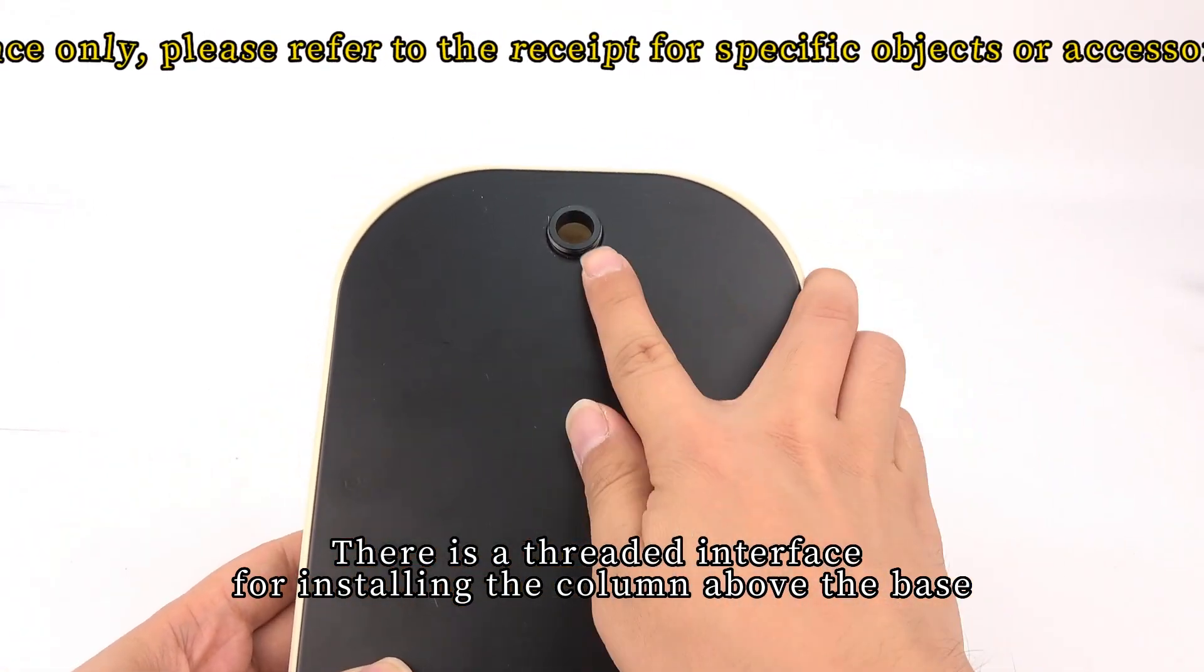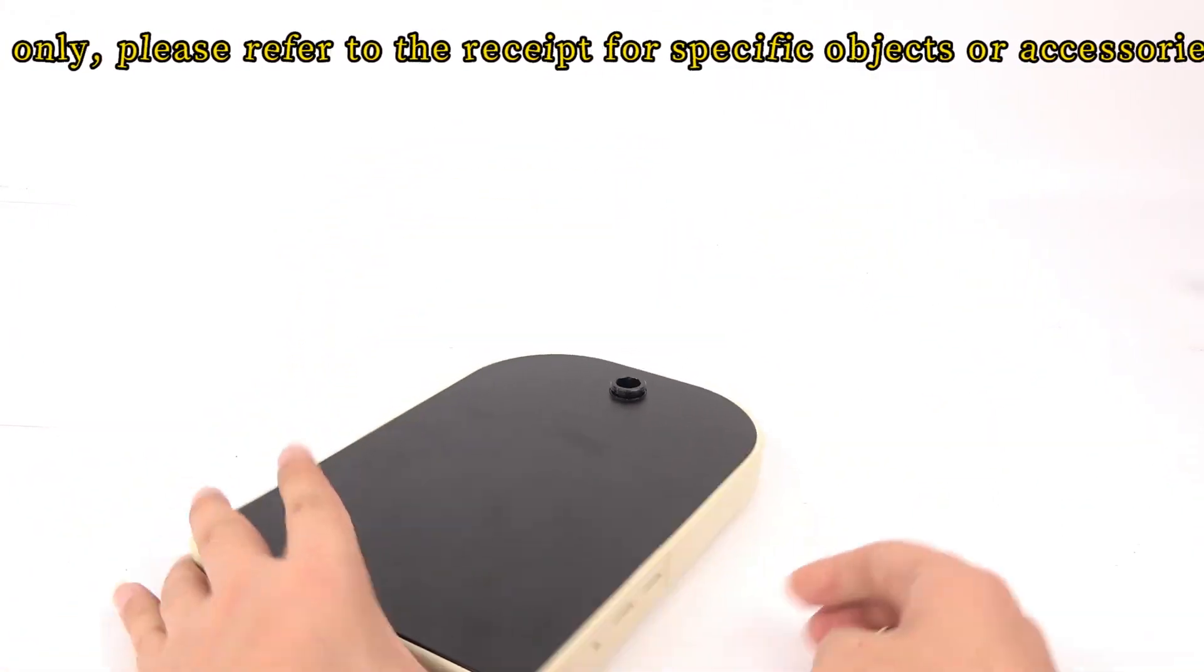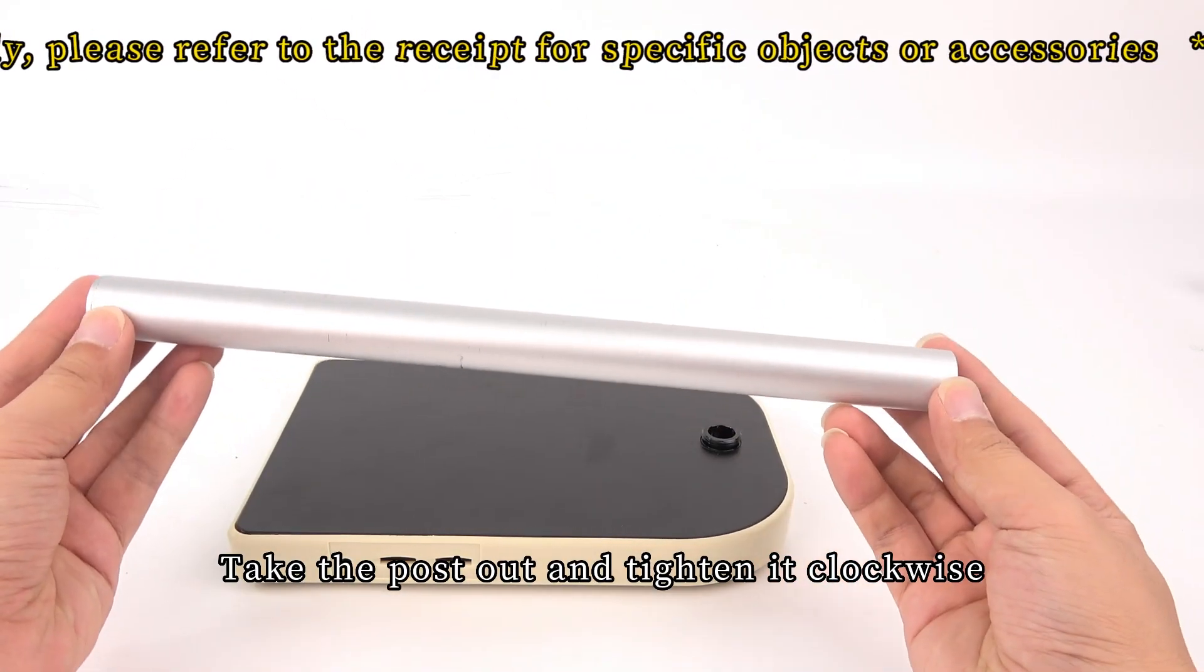There is a threaded interface for installing the column above the base. Take the post out and tighten it clockwise.